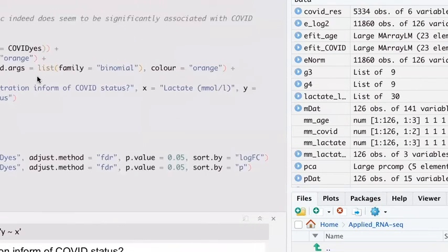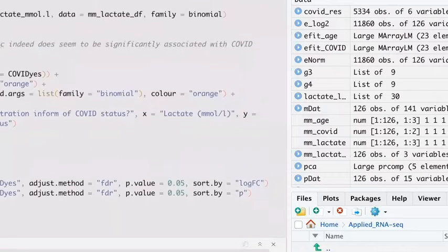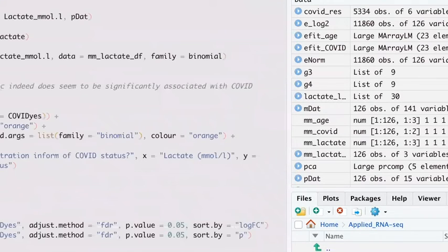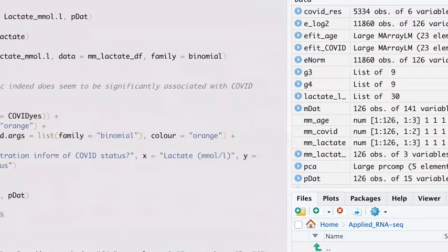So now, basically, if you want to do the fit again, you do the same exact steps as before over here. And that is the model that I will basically use further on. So again, I'm showing quality checks that you would use to choose which variables to get within your model.